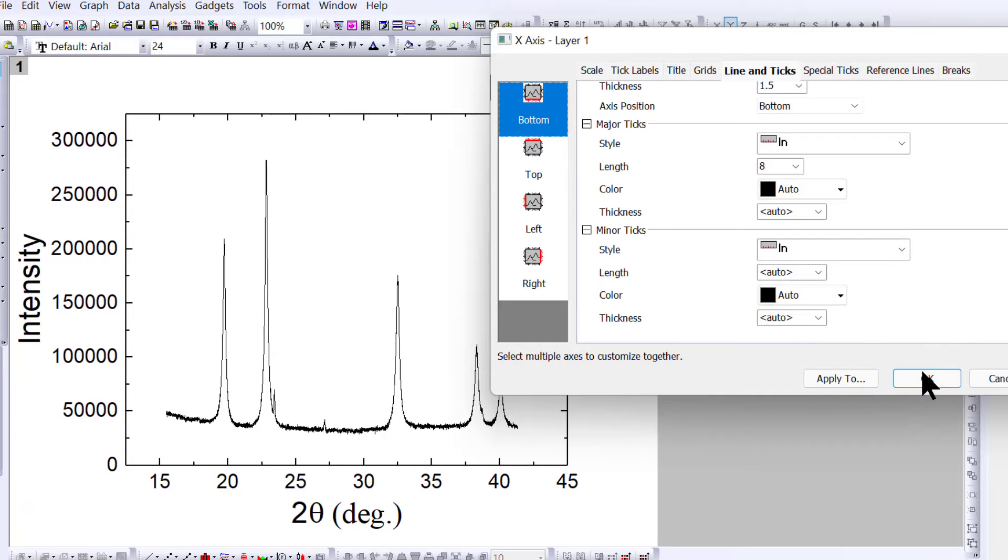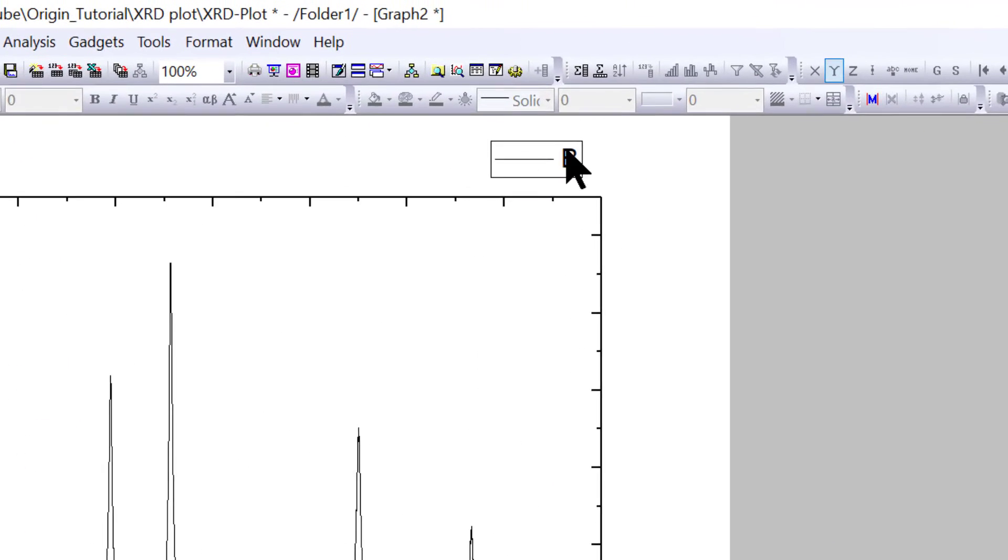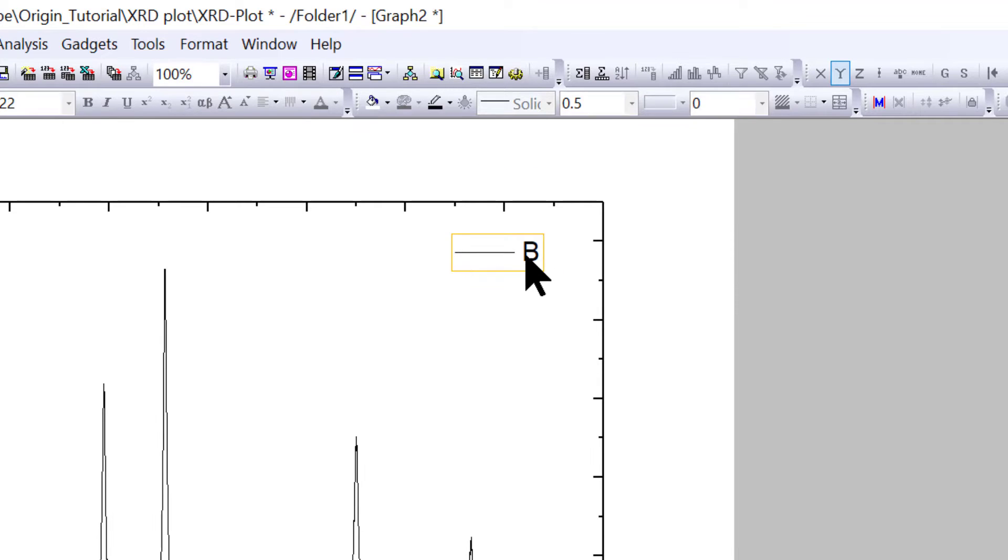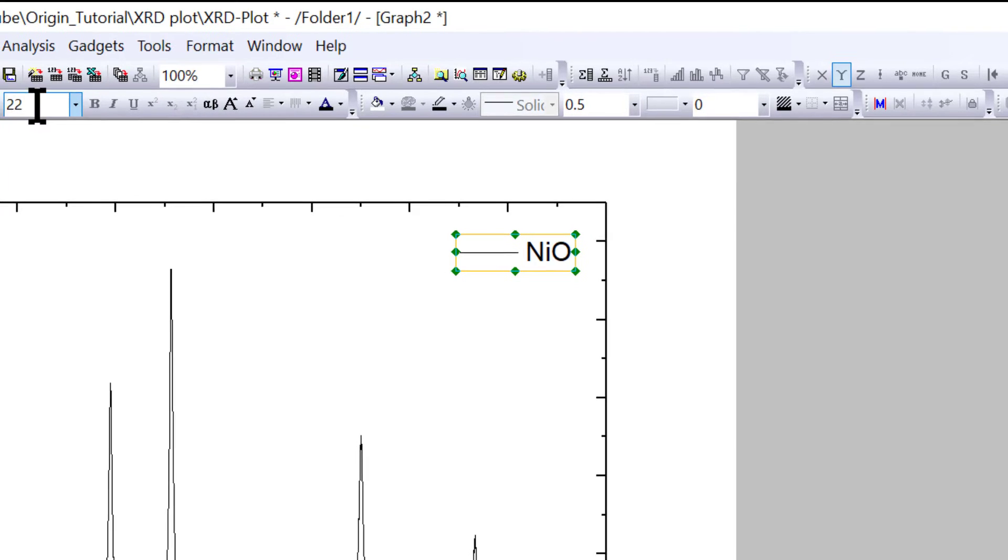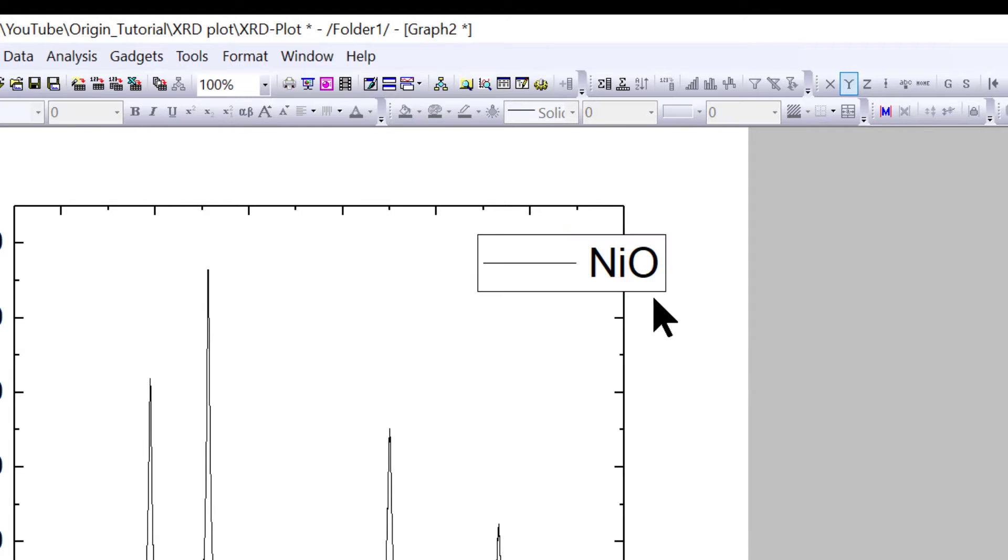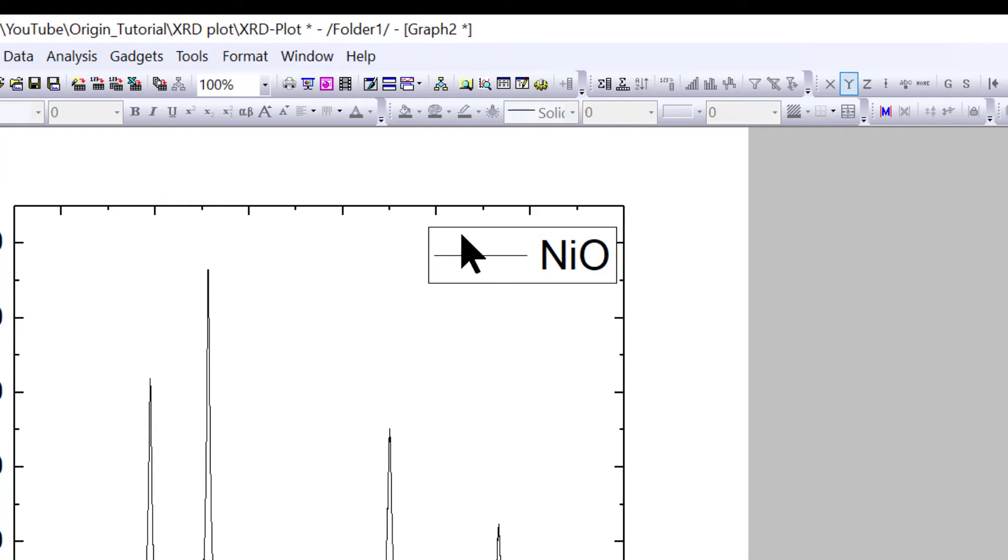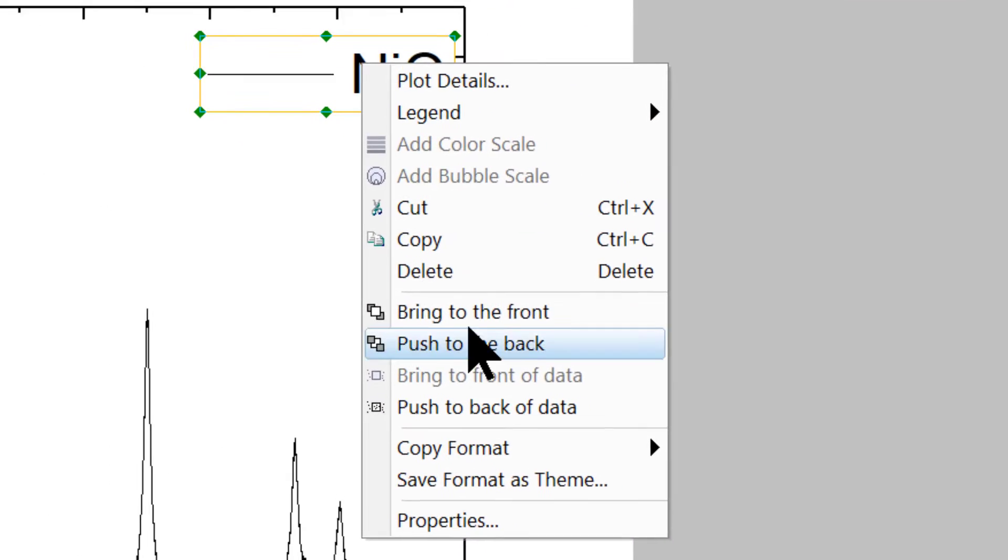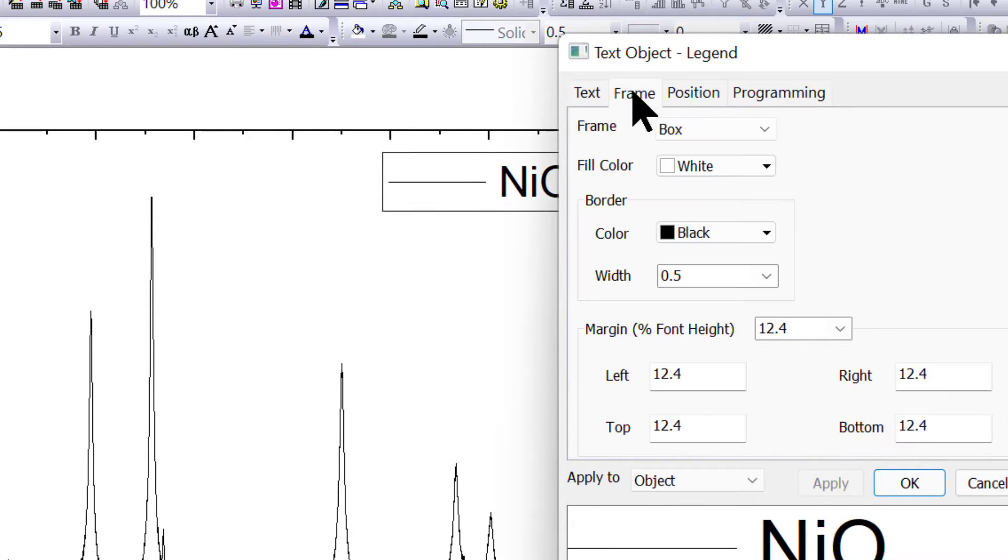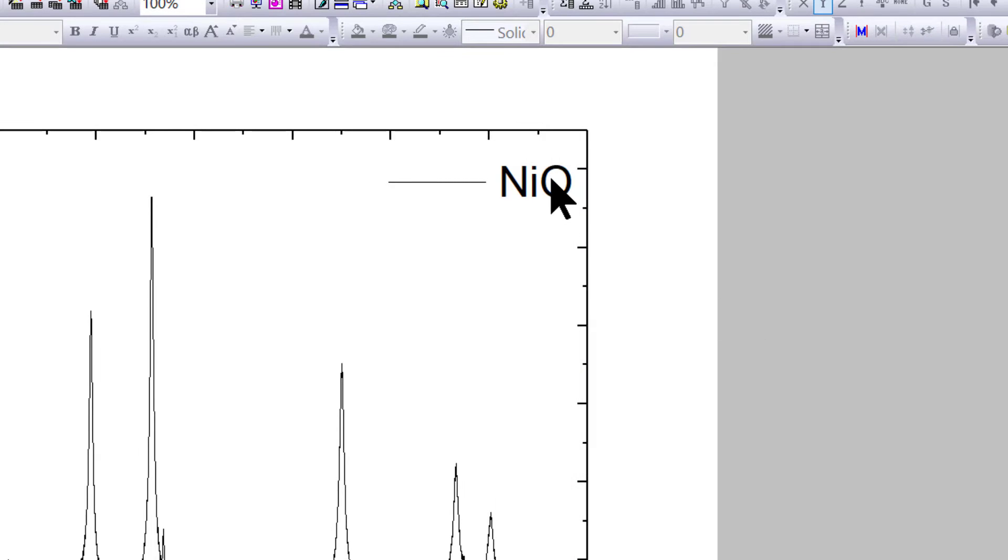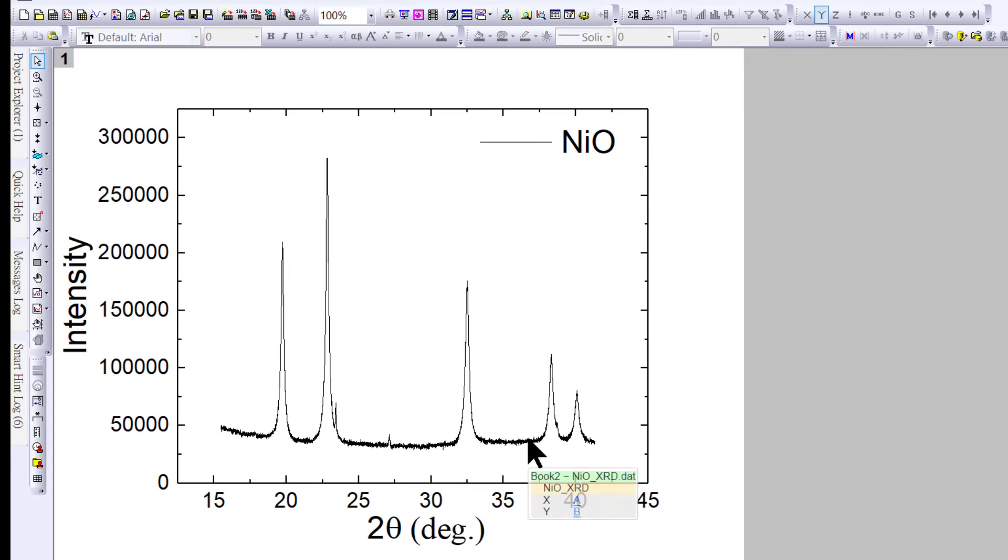That's it. It's very simple. If you want to write down the sample name, you can write here. This is NiO. You can change the font size as well. If you don't want to see this box, right-click on it, go to Properties, choose Frame, and select 'None.'